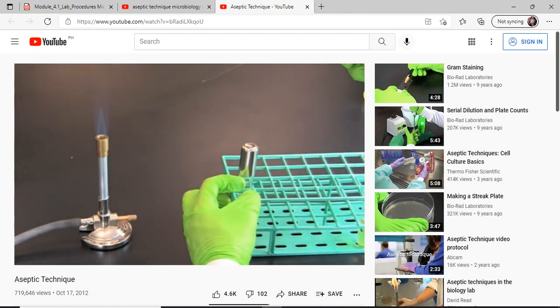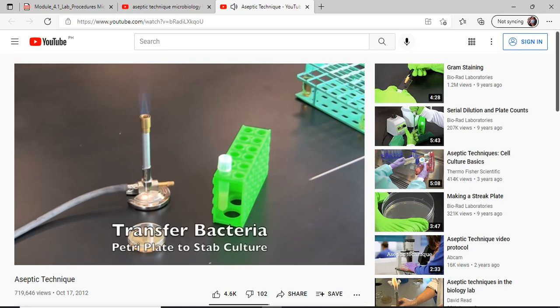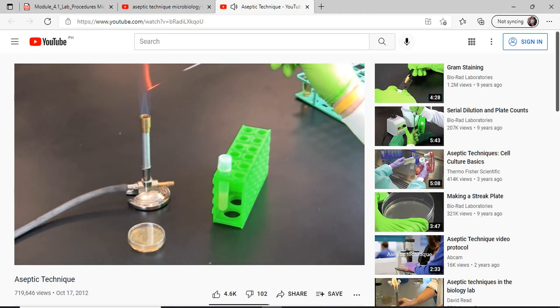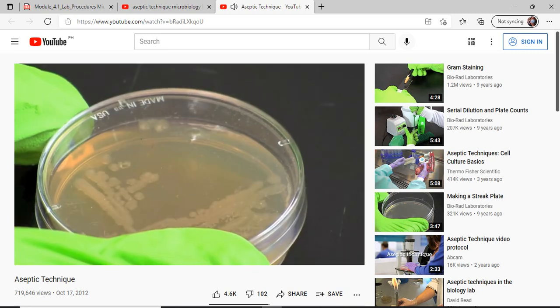While holding the lid as a shield, gently rub the inoculation needle over a single colony. Transfer the bacteria to a culture tube filled with nutrient agar. Remove the top of the tube and insert the needle, making 3 deep stabs.